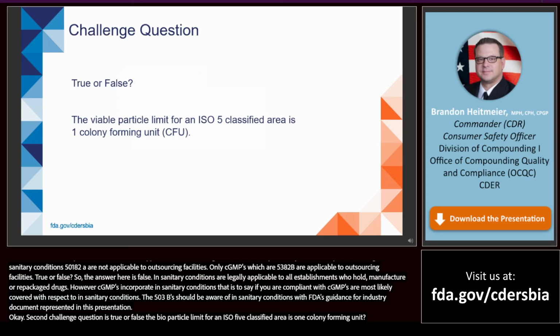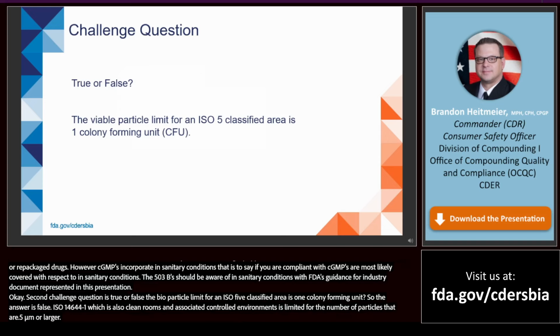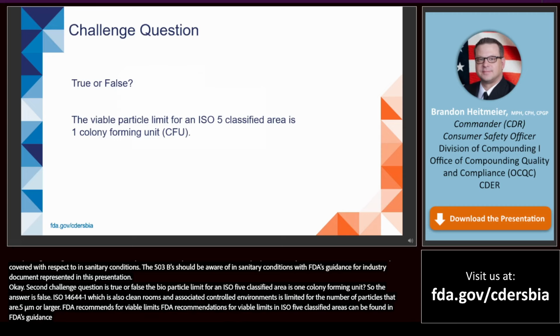So the answer is false. ISO 14644-1, which is also the clean rooms and associated controlled environments section, defines limits for the number of particles that are 0.5 microns or larger. The ISO standard does not set a limit for viable particles or CFUs. However, the FDA recommendations for viable limits in ISO classified areas can be found in FDA's guidance for industry titled Sterile Drug Products Produced by Aseptic Processing, Current Good Manufacturing Practice, which is referenced in this presentation.